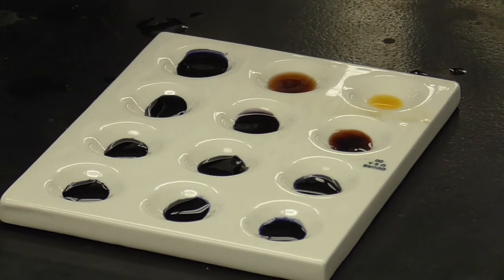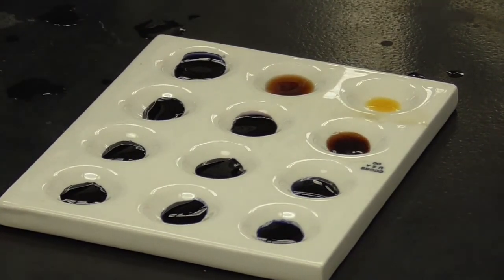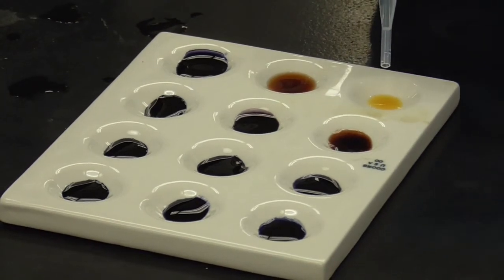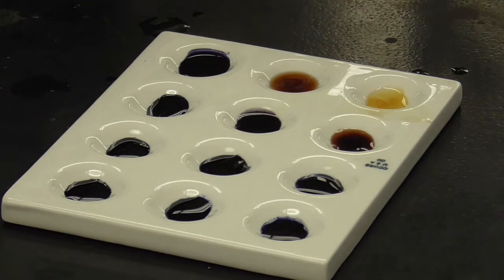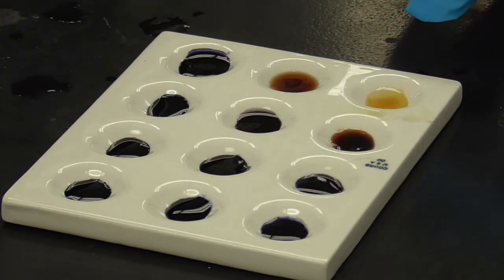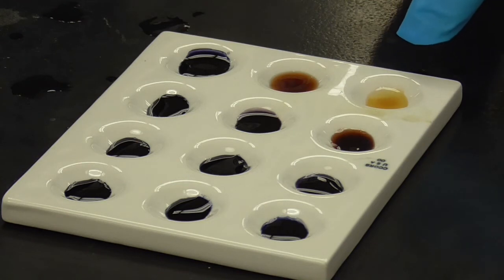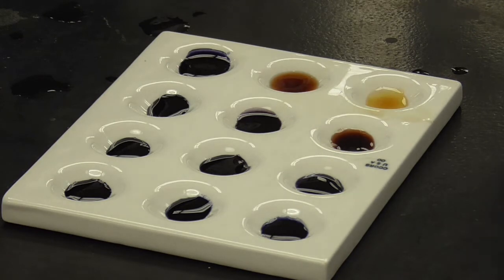How about tube 6, where I keep saying that, tube 4, where we put 6 drops of the enzyme. 1, 2, 3, 4. Wow, very light. In fact, that's so light, that's that gold color that we're looking at. So there's no more starch left in that one, is what we're seeing there. It has all been broken down.